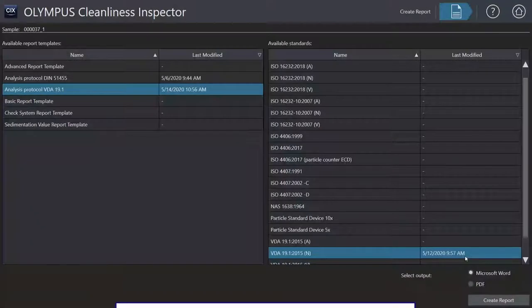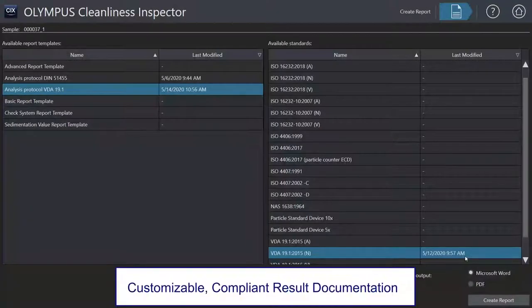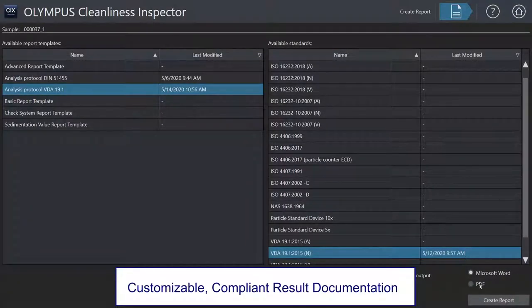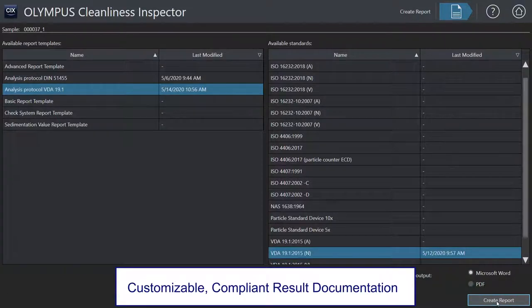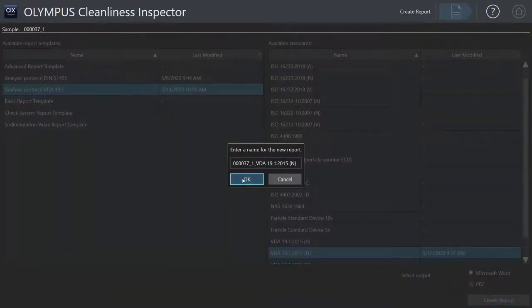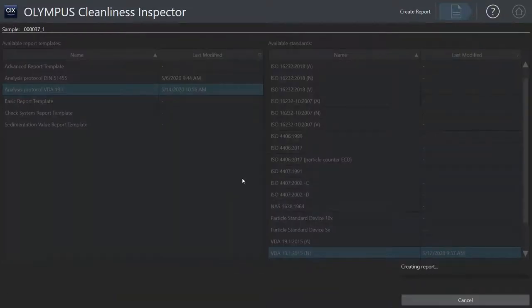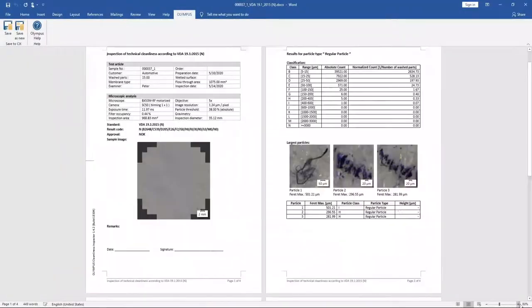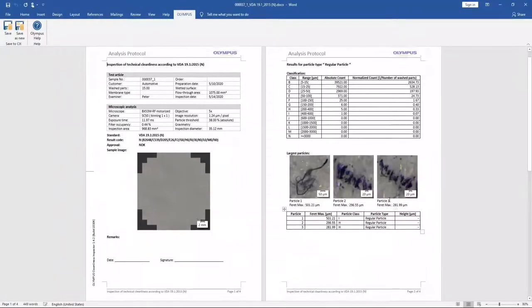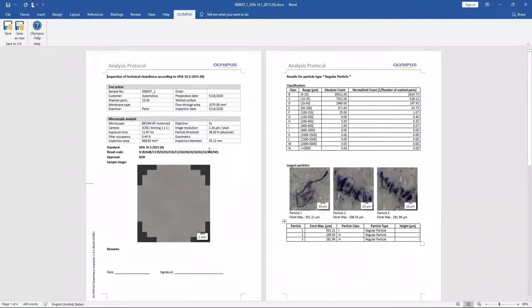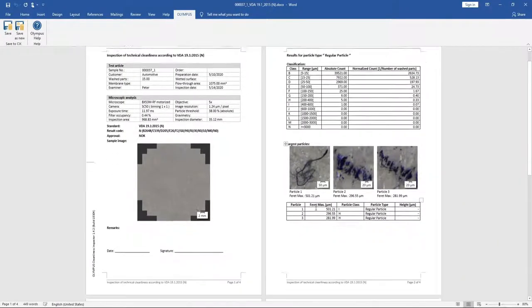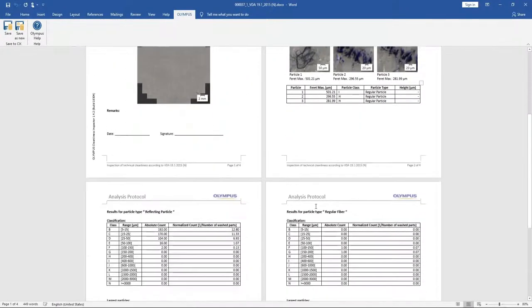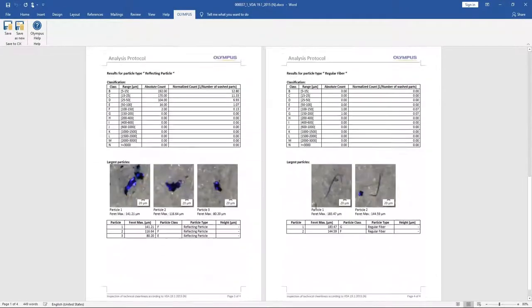Report templates that comply with industry standards help operators avoid mistakes and can be easily modified to meet the needs of your company. The final digital documentation is created in Microsoft Word and can be directly exported as a PDF for further distribution.